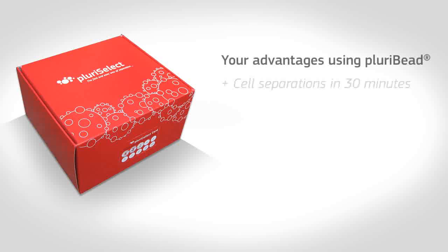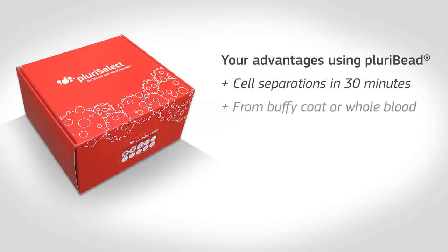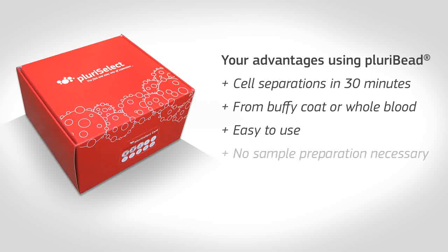With PluriBead, you can separate cells in only 30 minutes, even from buffy coat and untreated whole blood. It is easy to use. Furthermore, no centrifugation and no sample preparation are necessary. You obtain highly vital cells.